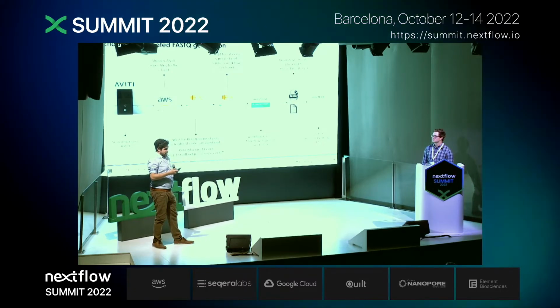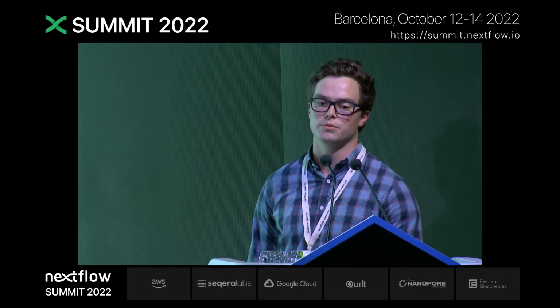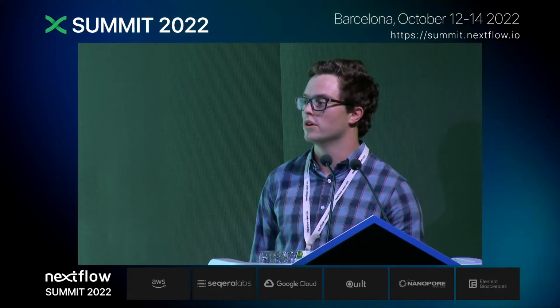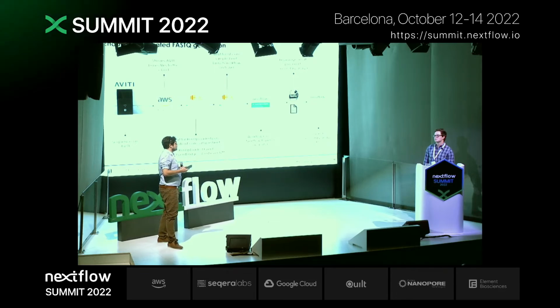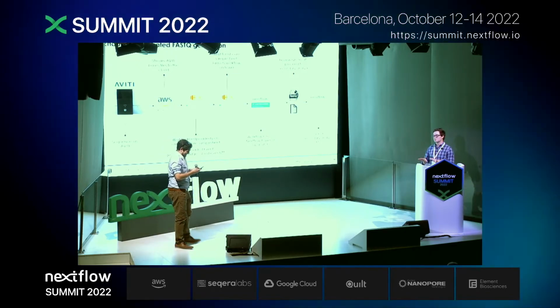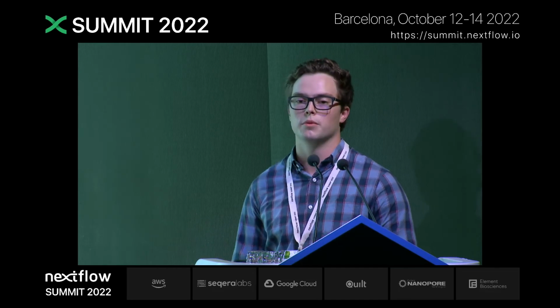Is there a version of the workflow that does not use cloud services? That's why we integrate into nf-core demultiplex. We just wanted to give customers an easy way to run it wherever they want, be it HPC, cloud, wherever, and that's what nf-core enables. And on the adapter trimming, how does that compare to BCL Convert? In what way? I can't speak to BCL Convert. We have options to trim as you're demultiplexing.